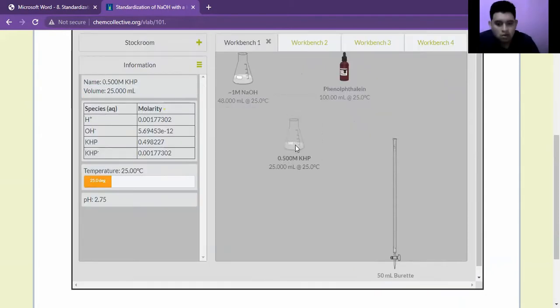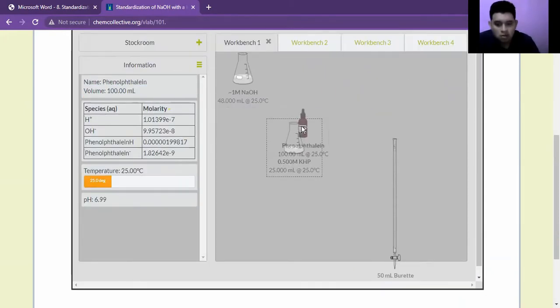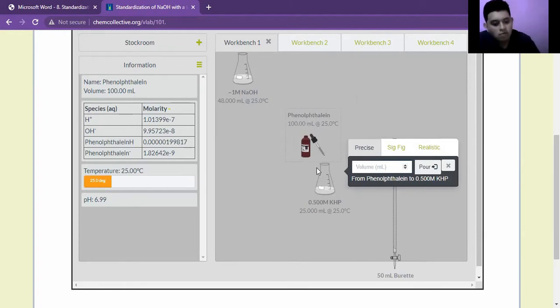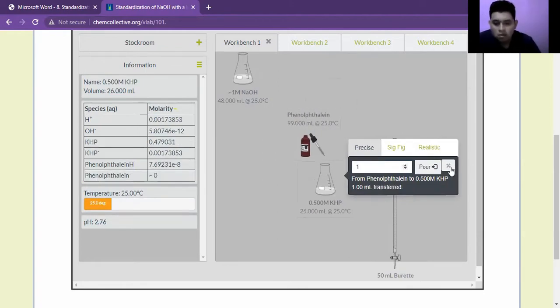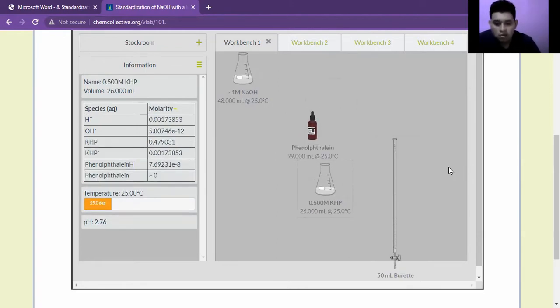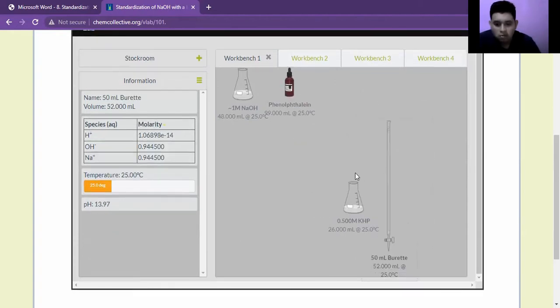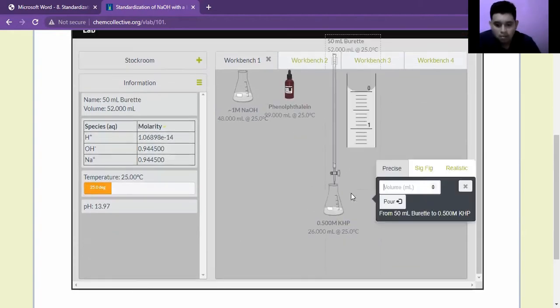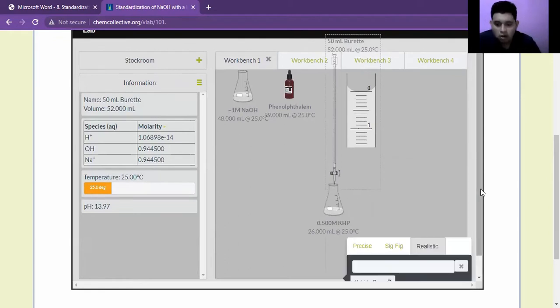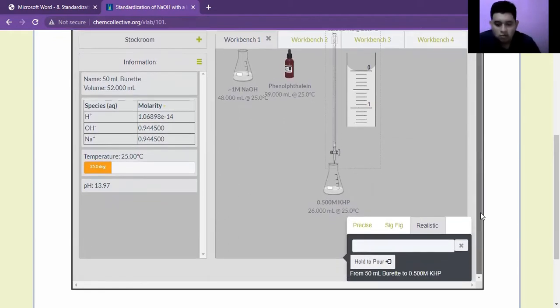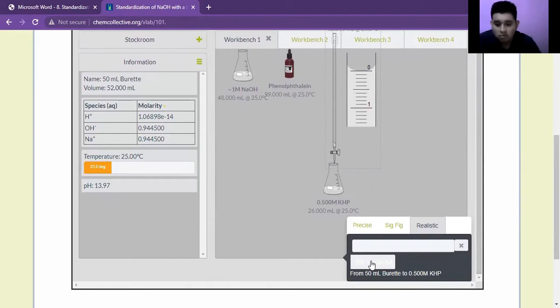Then we take the KHP and we will add 1 to 3 mLs. Therefore, we will add 1 mL of the indicator in the KHP solution. Then we will take the buret and we are going to perform the titration. We are going to add the NaOH solution to the KHP solution until the endpoint is visible.